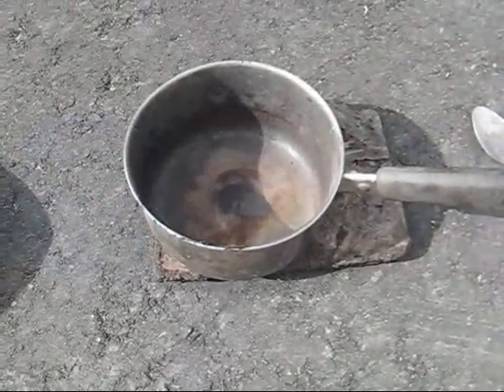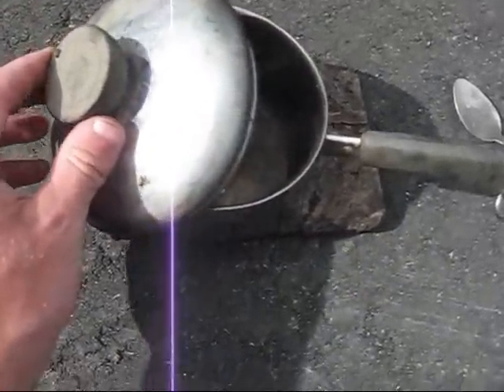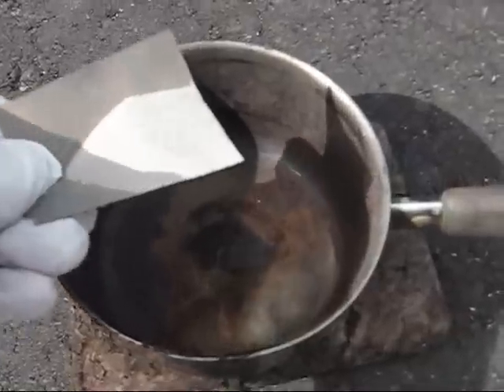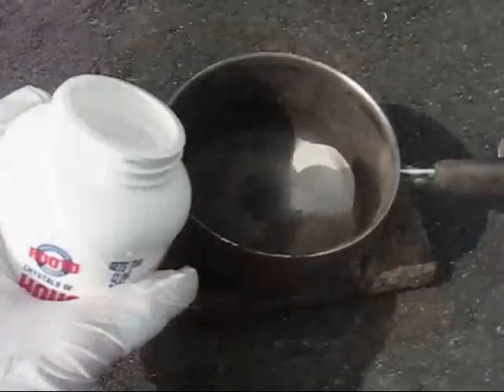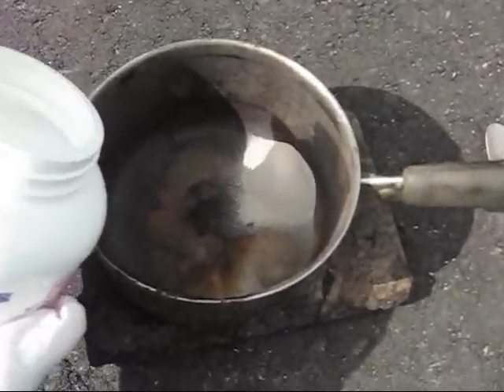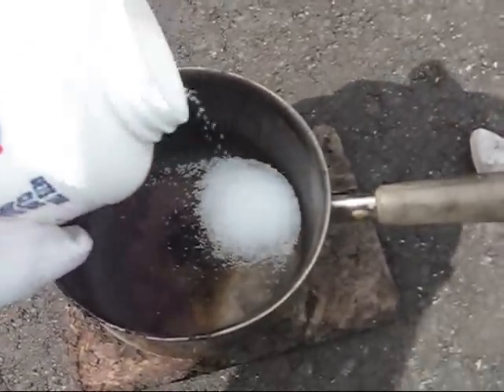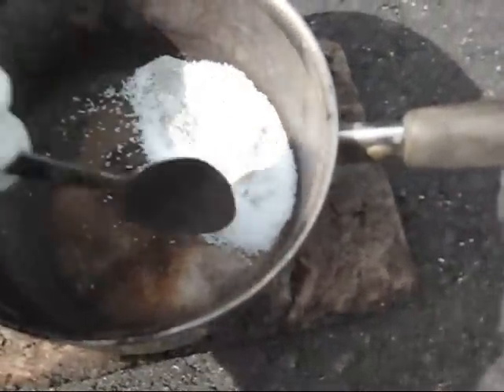I first acquire a suitable pan and lid to be my crucible for this experiment. Magnesium powder in a fairly fine form is then put into the crucible. Sodium hydroxide prills, otherwise known as lye, are then added in a slightly larger proportion by volume than the magnesium powder. The two chemicals are then mixed together.